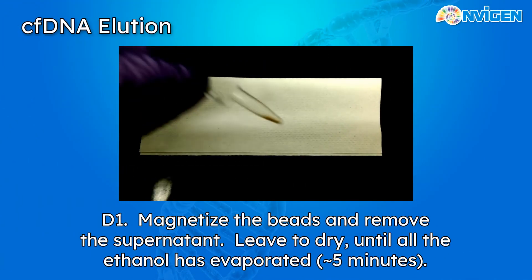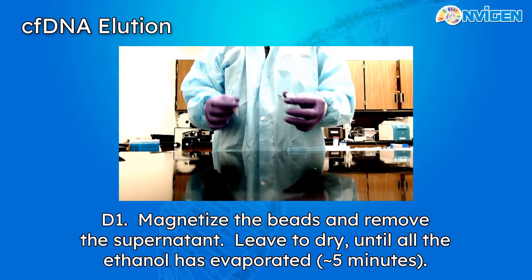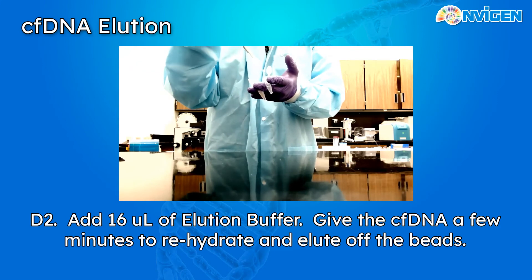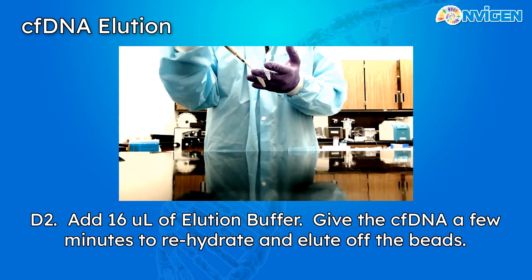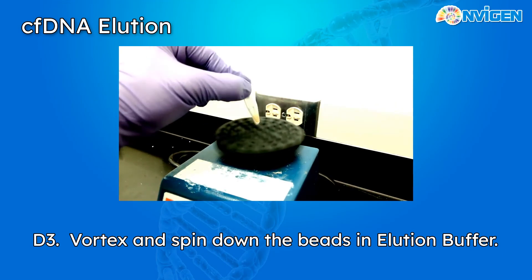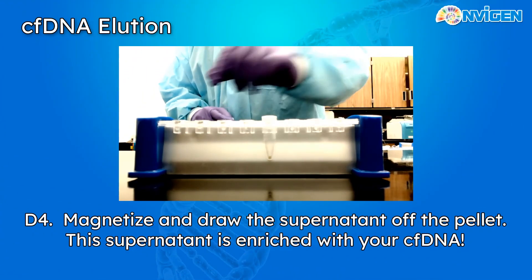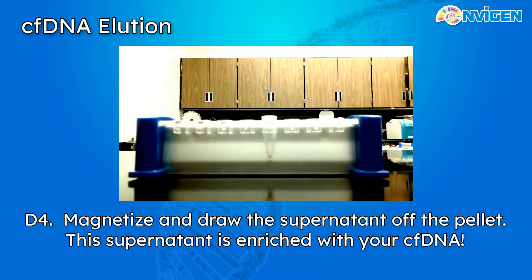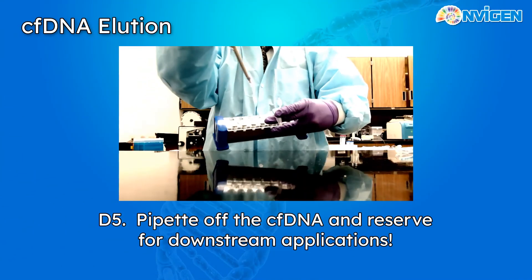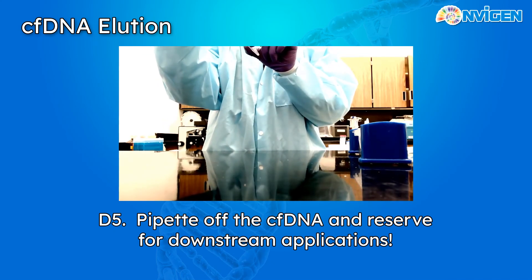Once the last ethanol wash has been removed, leave the beads to dry off to allow the ethanol to evaporate — it should only take about two to three minutes. Finally, re-suspend the beads in our elution buffer. For a 500 microliter extraction, use 16 microliters of elution buffer. Add it to the tube and after leaving it for a minute or two for the CFDNA to elute off the nanoparticles, vortex and then magnetize once again. This time the supernatant will be enriched with our CFDNA — pipe off the elution buffer and you now have your CFDNA extract.